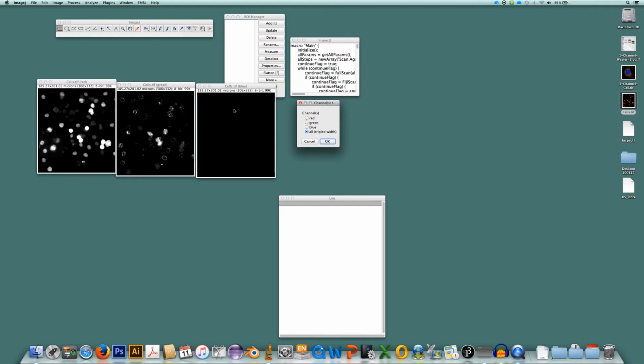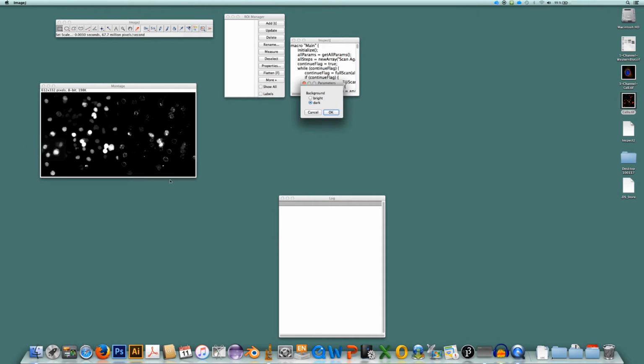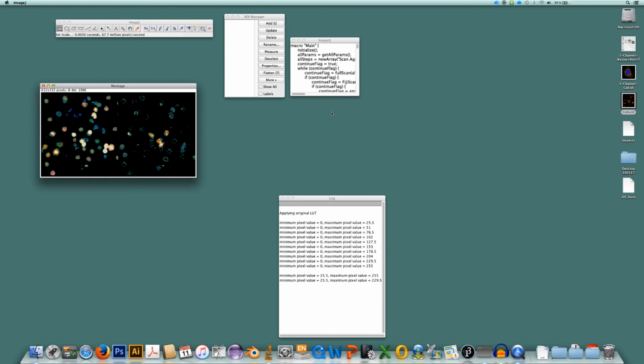But obviously you don't want the empty channel to be analyzed as well. The important thing here is you can keep all channels because InspectJ will recognize the empty channel and display only the channels with content. So here you see this was previously the red channel and this was previously the green channel, but there is no blue channel here. And then you can continue with the analysis. Okay, we don't need to continue here, so I delete this.